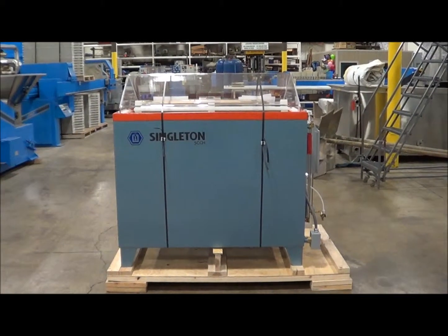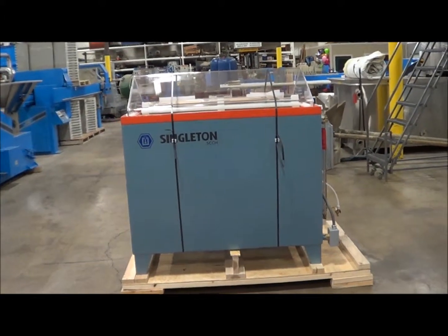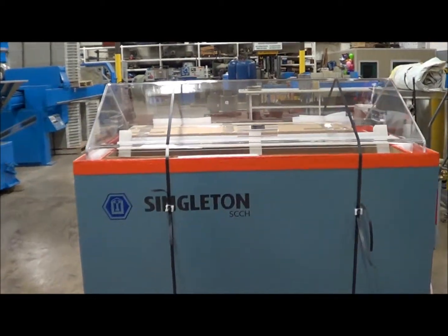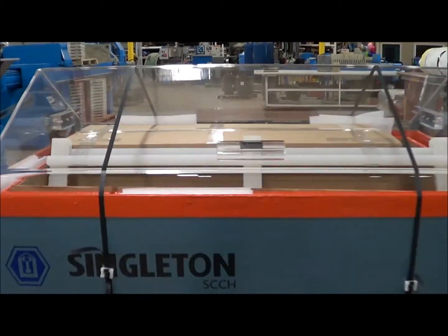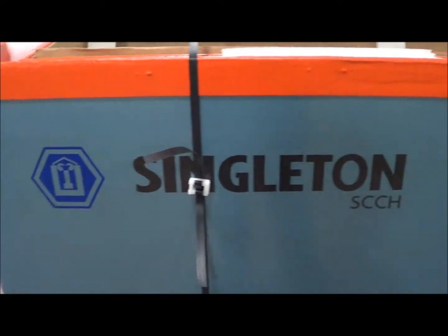Hello, today you're looking at a Singleton salt spray cabinet brought to you by Lanco Corporation. This is Singleton model SCCH22 — a 30 cubic foot unit, model 22. This is a brand new unit from Singleton that was just received into our inventory.